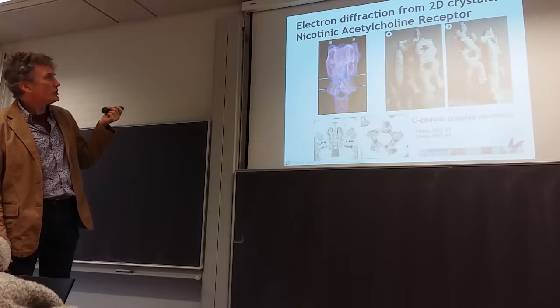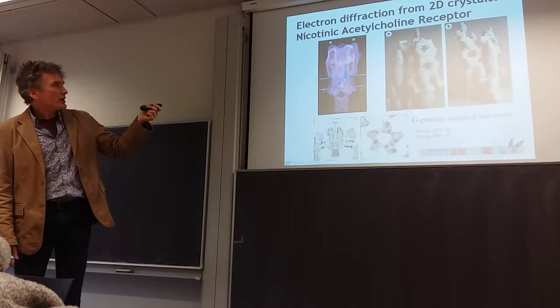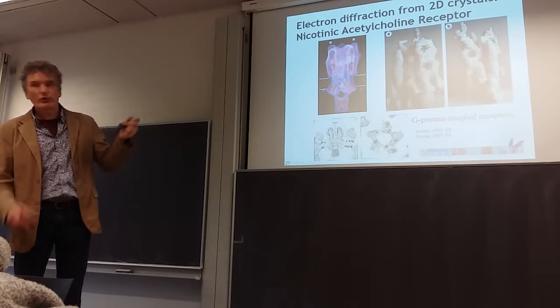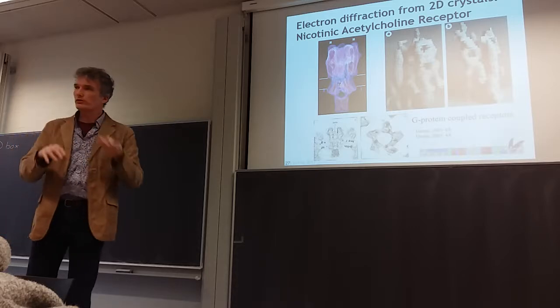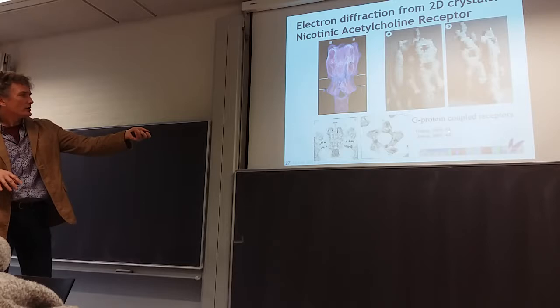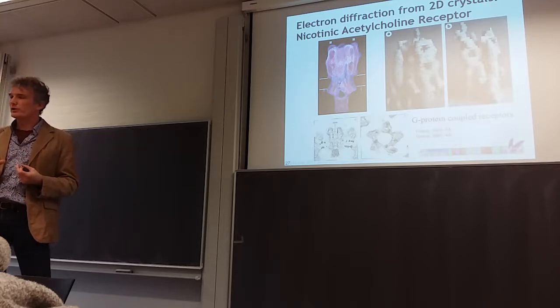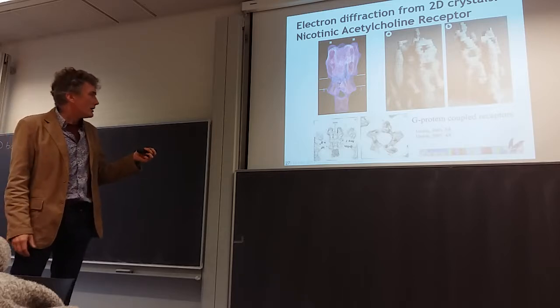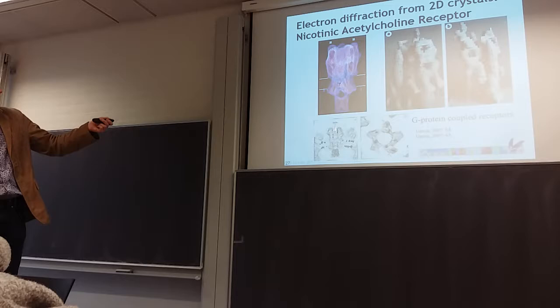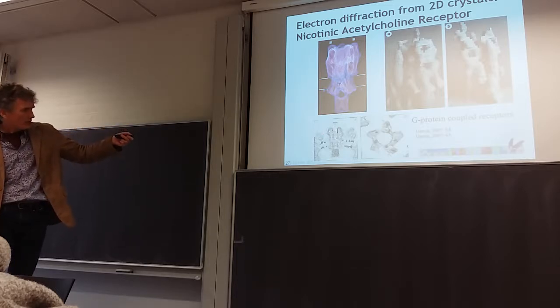So you can see that the resolution is quite low, right? These stacks are individual helices, and sometimes you can't really separate them well. So that's the limit of the resolution. I thought it's 9 angstrom resolution, right? So that's about the diameter of a helix. And these are a few views from a cross section where, if you squint a bit, you can see that there's a channel here in the middle.